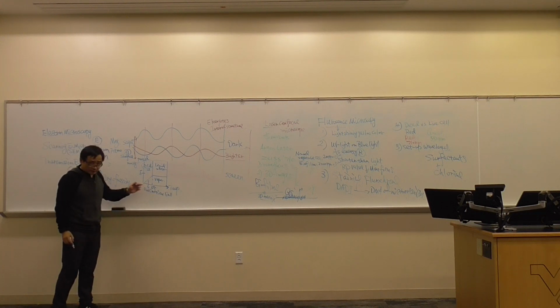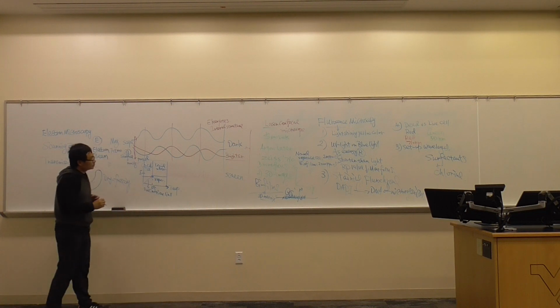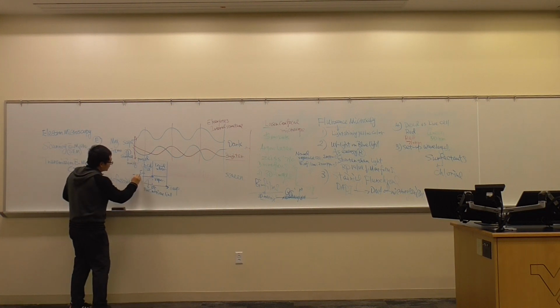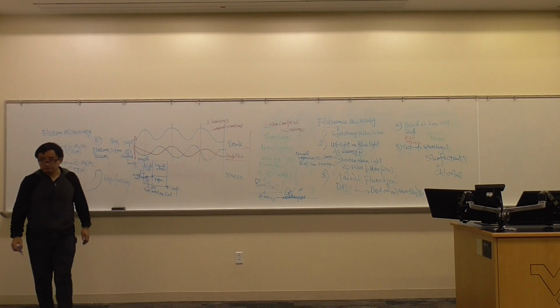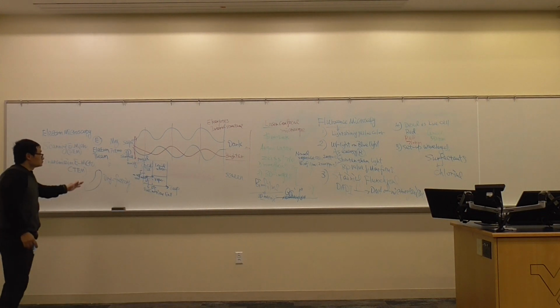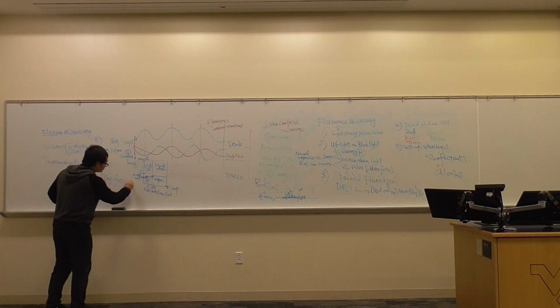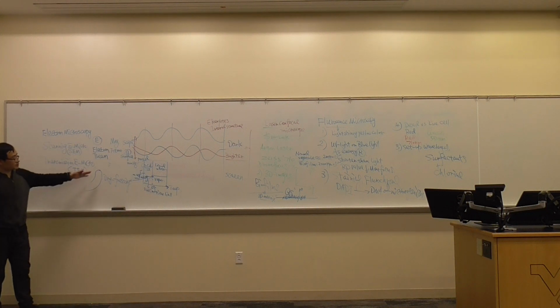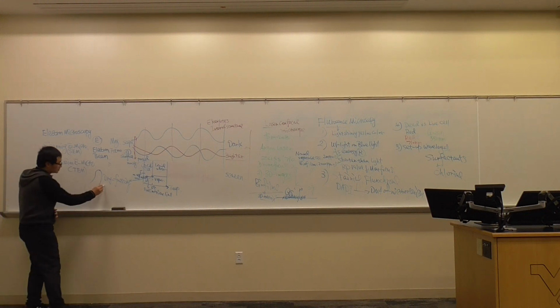If the temperature is low enough, as long as I make sure the equipment pressure is less than 4.8 millimeters of mercury column, the solid will directly become a vapor. That's called sublimation. And that is the principle of dry freezing. So basically the specimen, you have to dry freeze it, make it very frozen, immediately, because we have to slice it. Then we slice it.